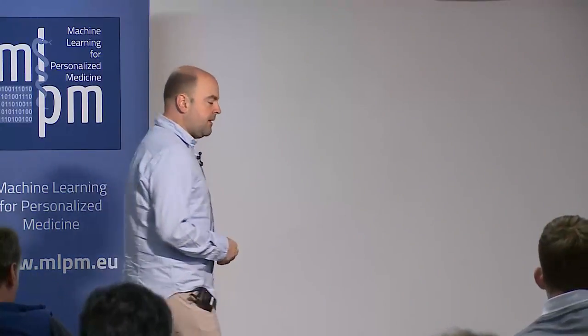So a standard approach for doing that, again, with machine learning approaches is you just run a whole gamut of different workflows, different aligners, different variant callers, and say, okay, my likely true positive set is the set where every single method agrees. That underestimates it. You're going to lose a lot of true positives, but at least it's a good enough training set.